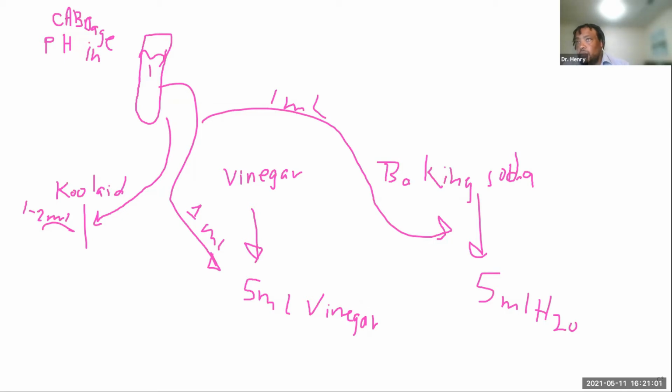Just to clarify, the baking soda is a quarter, right? Quarter teaspoon. And then 5 mils of water. Of water, yep. And then you said it'd be best to use the distilled water, right? Yep.